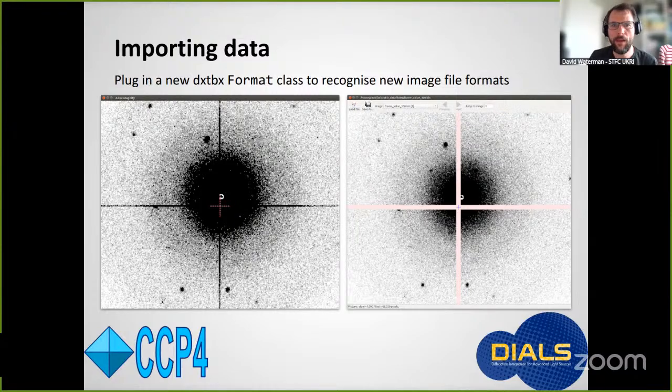That means when you view the image array as it is here using the ADXV package, you get a distorted view of the real space on the face of the detector, because it doesn't know that these pixels are wider. So you're not representing the detector space properly.